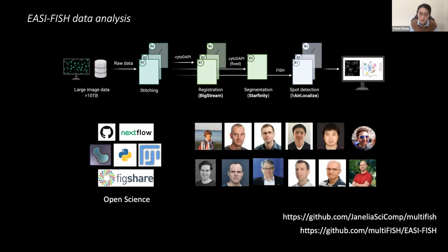This is largely a collaboration within Janelia, as well as with people at the Max Planck, and many software engineers have helped out, especially with building a very convenient pipeline. I am really coming from an experimental, molecular biology background, so I am trying to think from the perspective of how we can make use of the outputs that come out of the pipeline and make sense of the data.